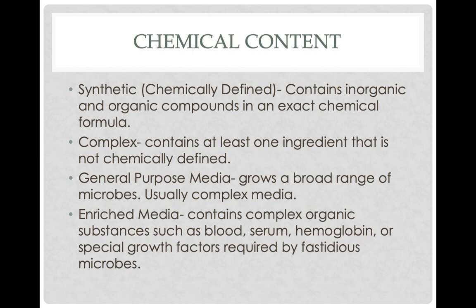They require salt in their diet, or they require iron in their diet, or they require a certain amount of protein that maybe is not going to be able to be found in a nutrient agar and things like that. So if you want to grow these types of bacteria, you have to give them specialized media that gives them the stuff that they have to have. So fastidious microbes require certain types of nutrients that general purpose medias don't usually have. So if you want to grow a fastidious organism, you have to give it those specialized growth factors in the form of an enriched media.